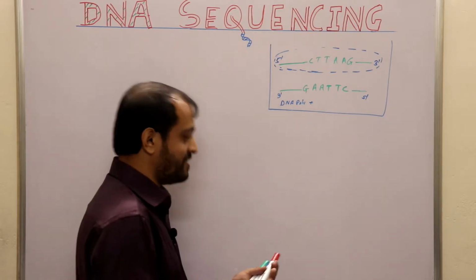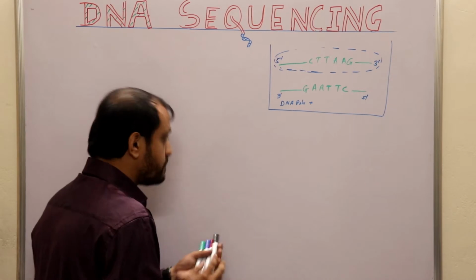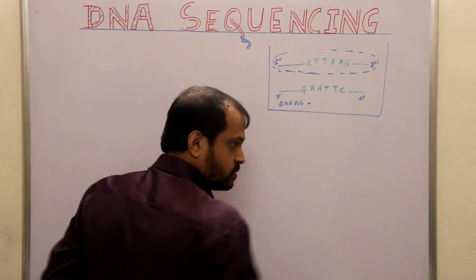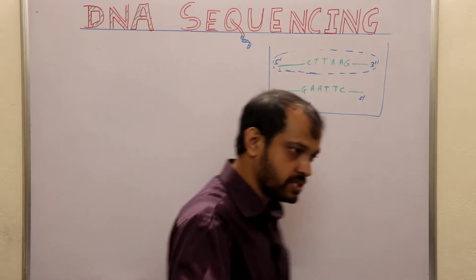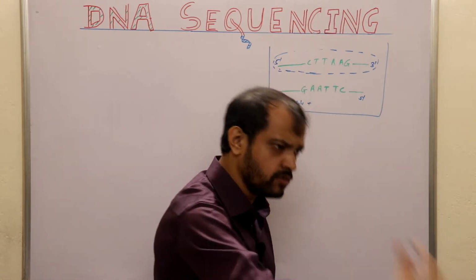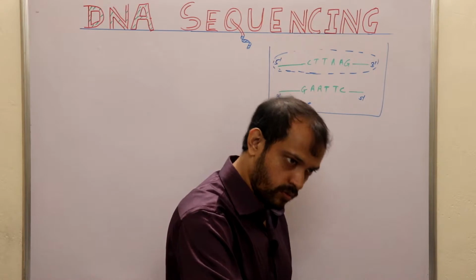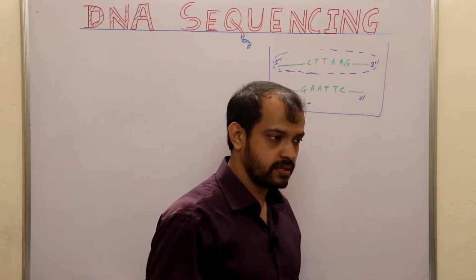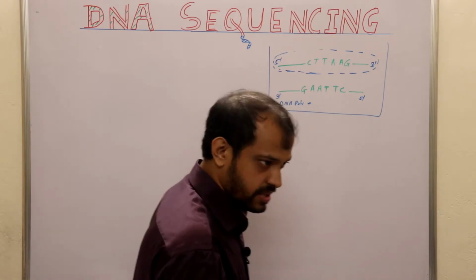Now listen. Obviously, when the guessing part becomes more, then let us give the sequence of one of the strands to the computer. Let the computer do the whole work. Then we will take the sequence and upload it to the online library. Okay, that is our job.